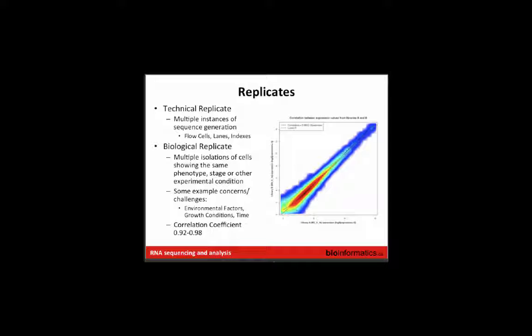So we have a couple QC components in the hands-on tutorial, and there's quite a wealth now of tools to help you evaluate QC, and some of the metrics we'll talk about are quite particular to RNA-seq, so we'll try to review those. Here's a quick question on replicates.